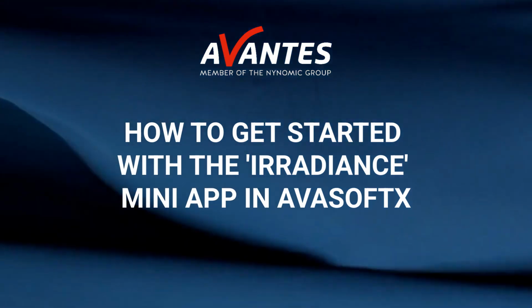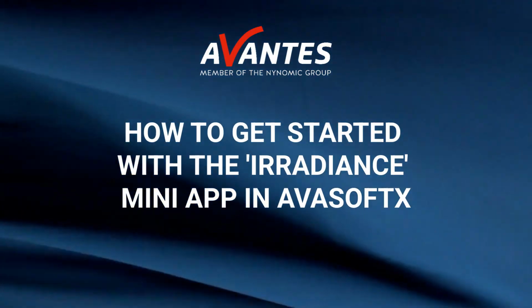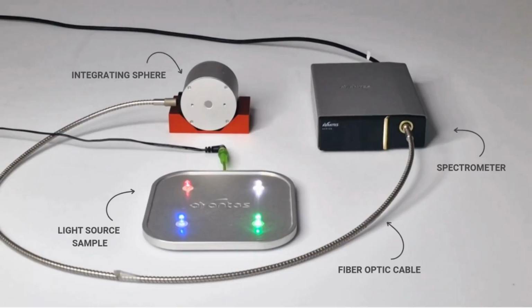In this video, you'll learn how to connect your spectroscopy setup with the Irradiance mini app in AvaSoftX. You need an intensity-calibrated spectrometer, a fiber optic cable, an integrating sphere or cosine corrector, and the light source to be measured. In this video, LEDs are used.